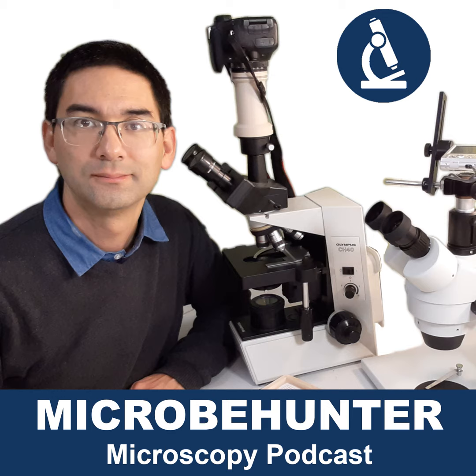So let's continue. Mistake number 5, using the coarse focus knob with the high power objectives. Also something you shouldn't be doing. Many microscopes have 2 focus knobs, a coarse and a fine focus knob, and the coarse focus knob should only be used with a 4 times objective. The fine focus knob can be used with all objectives, of course, but you should never use the coarse focus knob with the high power objectives, because you simply risk crashing the objective into the slide. You don't want that. It's bad for the slide, it's bad for the objective.